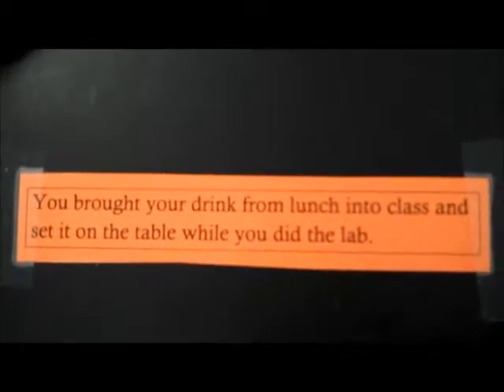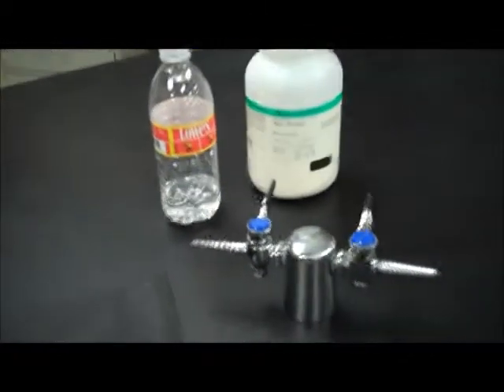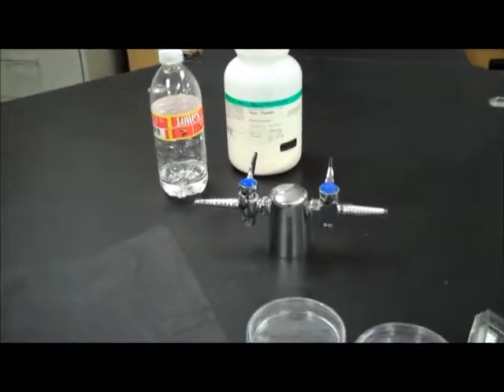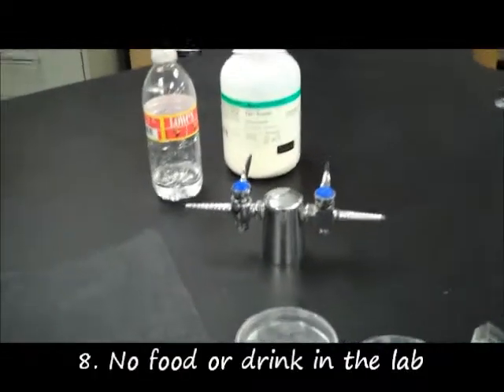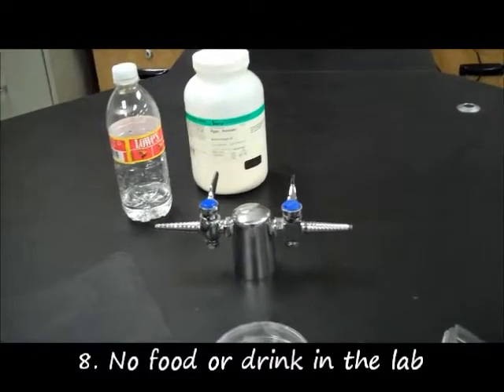In this situation, you brought your drink from lunch into class and set it on a table while you did the lab. In this situation, our drink is a water bottle. Now, the rule you need to follow in this situation is to not bring food or drink into the lab. This is important because your drinks or your food could be contaminated with whatever it is you're working with.